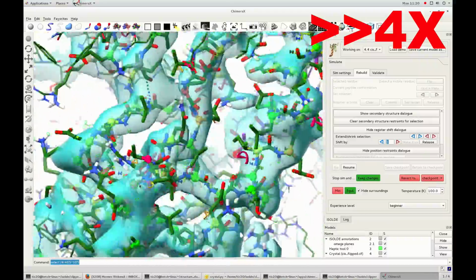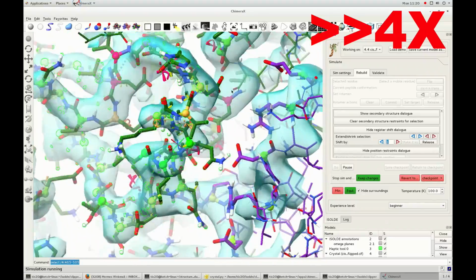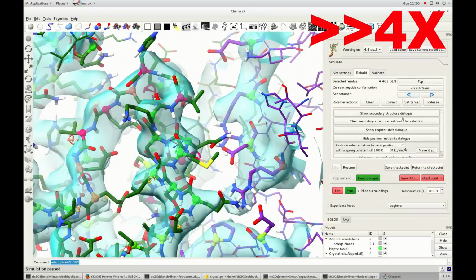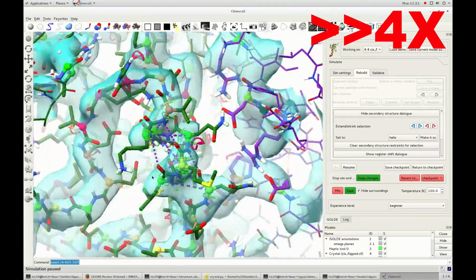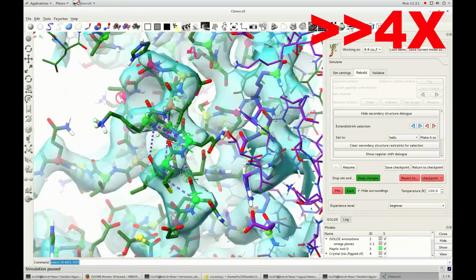Remember, it's still not necessarily a good idea to attempt perfection at this stage, while there's still the possibility that there are other large-scale errors in the surrounds. Once you're satisfied that the result is essentially correct, or at least more correct than before, it's best to move on, then come back later for the finer scale cleanups.